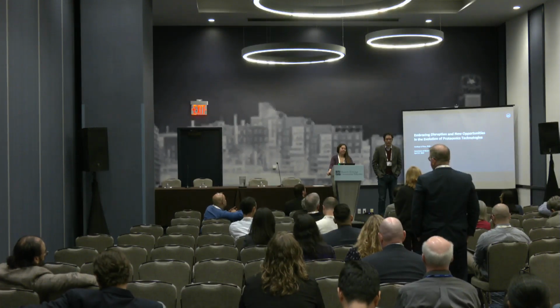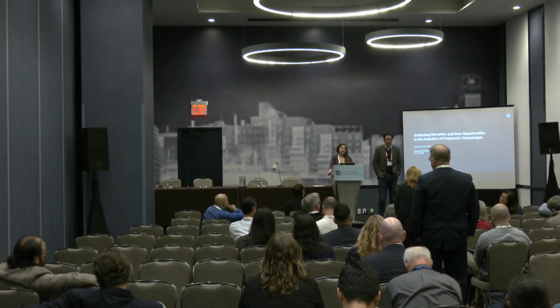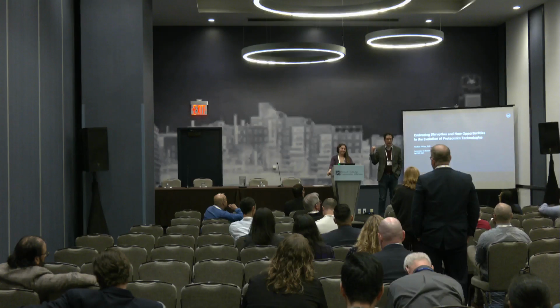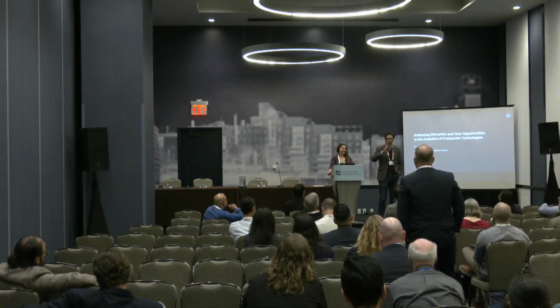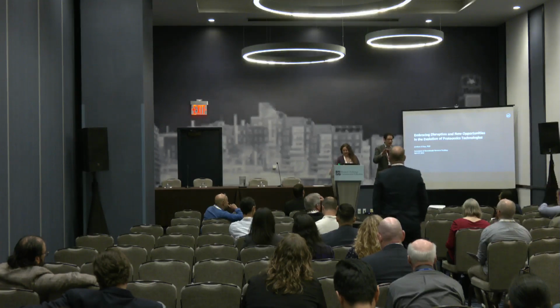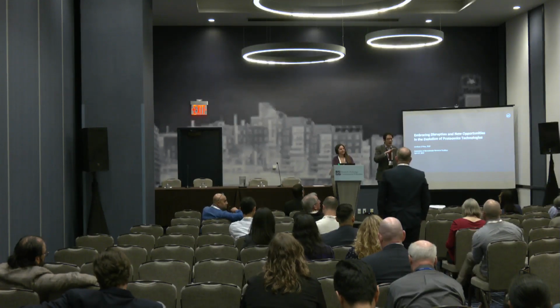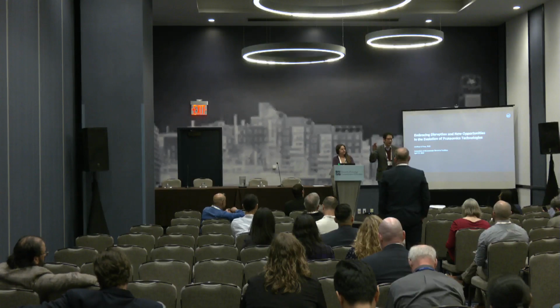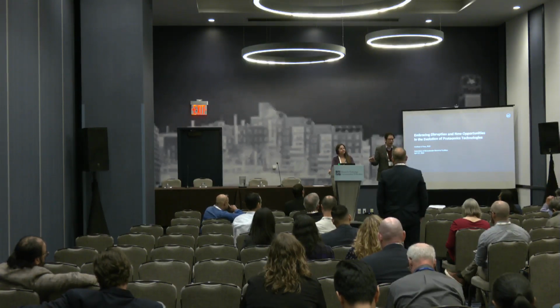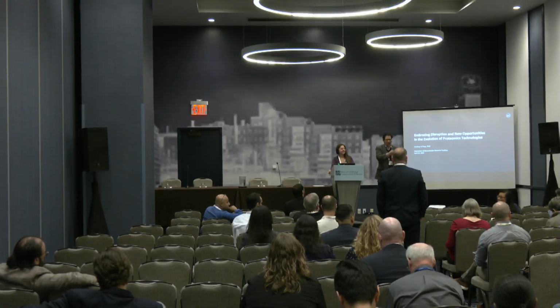For the mass spectrometrists, and I don't do mass spec, but we are desperate for a 384 well plate format, high throughput proteomics that can measure cytokines, for example. Yeah, so I hope Lindsay is going to talk about that. That is getting a lot better. Throughput has gotten a lot better with mass spectrometry, as well as these other techniques that are designed to deal with 96 well plates or 384 well plates too. Okay.